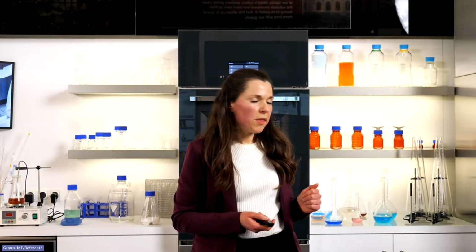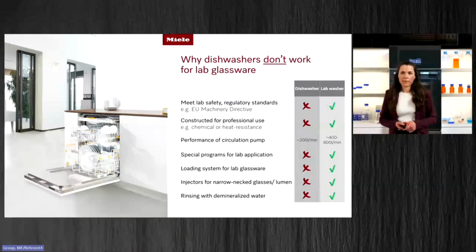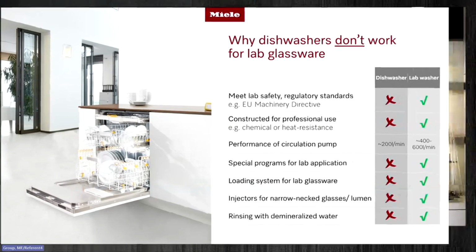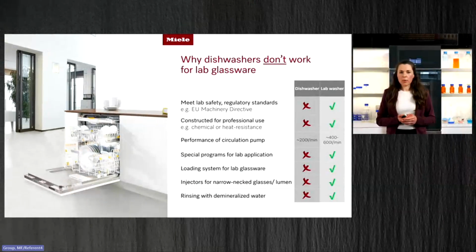So let's continue with the question that we often get from the market, and that is, can we also use a dishwasher to clean laboratory glassware? The short answer is no. Dishwashers are not suitable to clean lab glassware. First of all, domestic dishwashers are not approved for laboratory use. They simply don't meet the professional safety standards that laboratories require. They are also not designed for professional use.